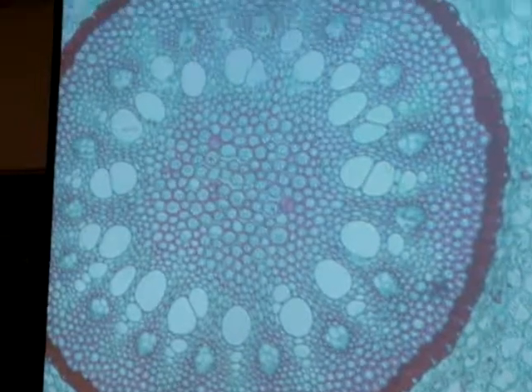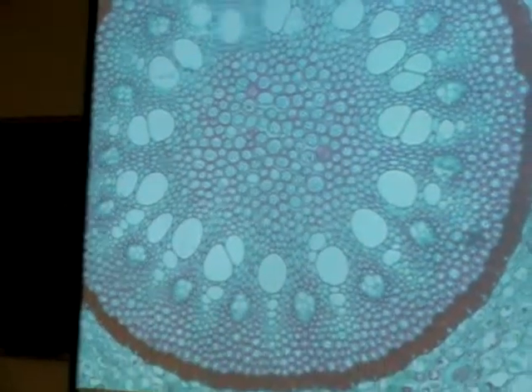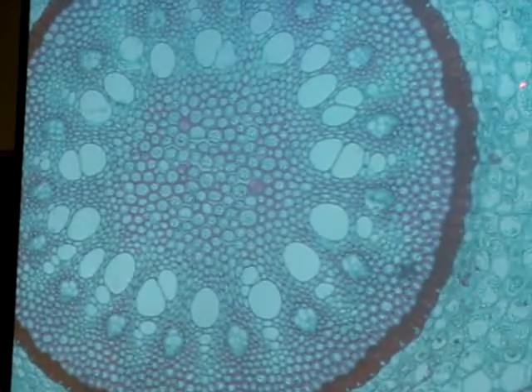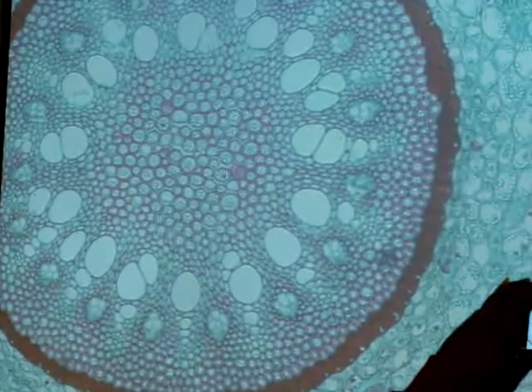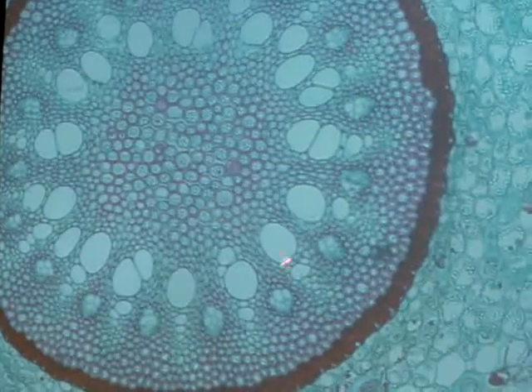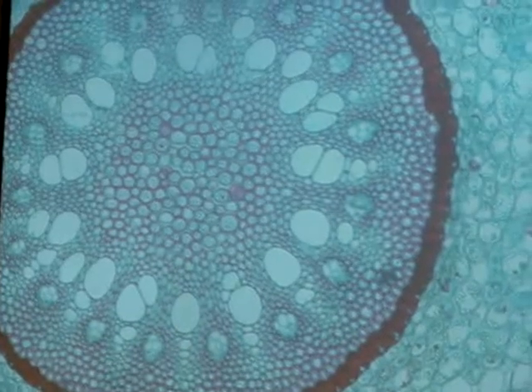Okay, much more exaggerated. Monocot or dicot? Monocot, right? You still have a pith. Now, this one, if you were guessing, you'd probably go, okay, this is probably a bit more xerophytic because there's an endodermis. It's very, very thick. Again, you can see the xylem, you can see the phloem kind of intermingled amongst. See the parenchyma, more parenchyma.